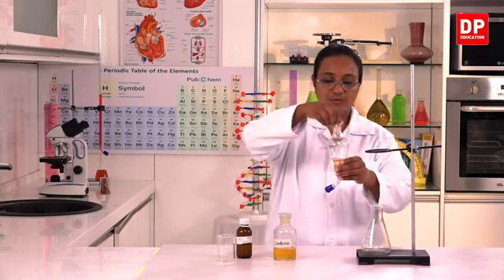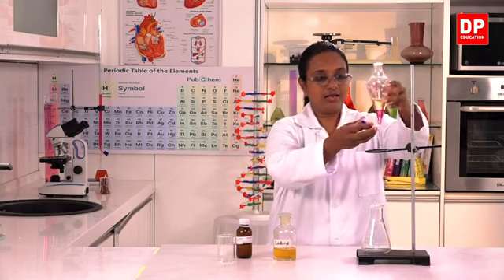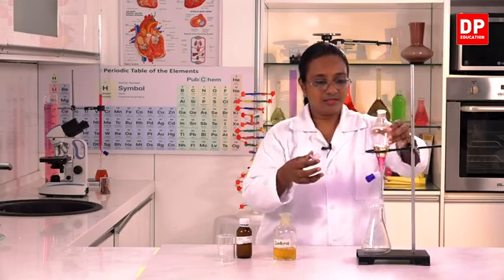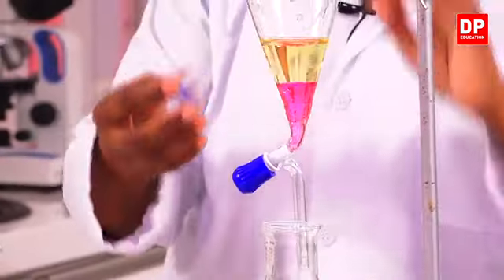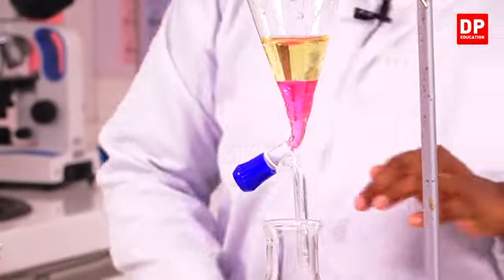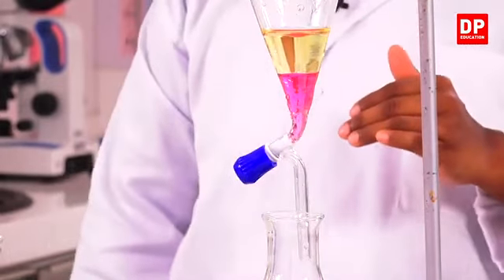Now I will open the lid and I will allow the mixtures to settle down. As you observe, you can see the separation of the two layers.